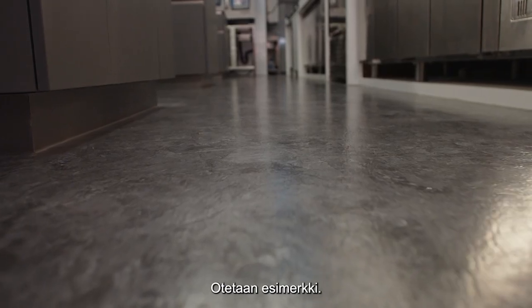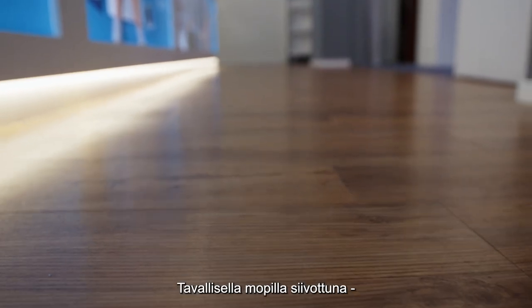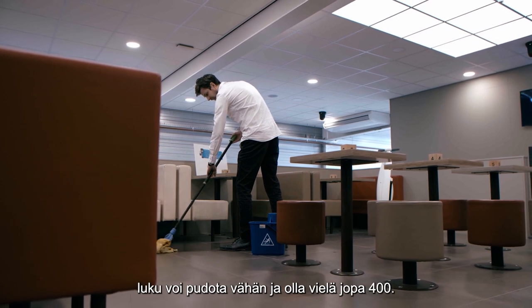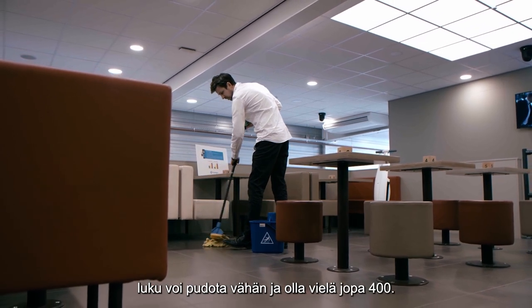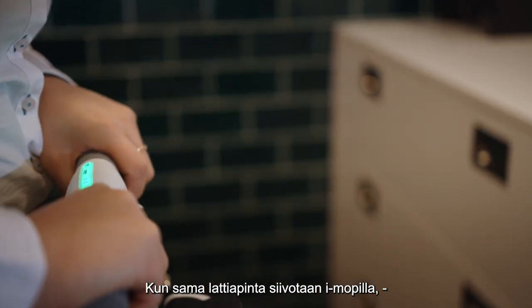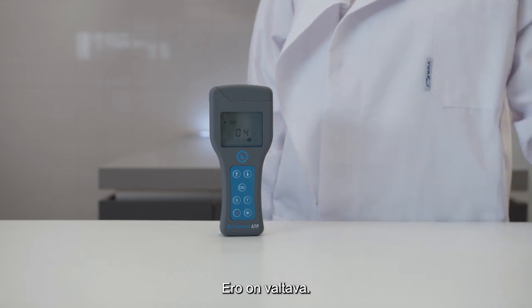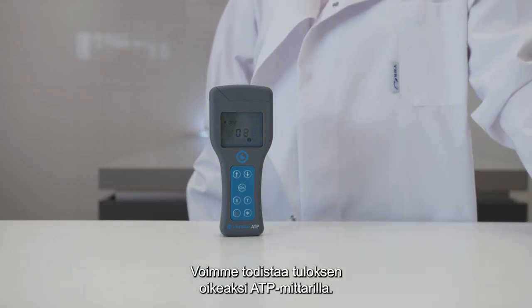Take the matrix for reference. Before cleaning, a surface can have a score of up to 800 RLU. After cleaning it with a normal mop, the score can reach a high of up to 400 RLU. Now, if you clean that same floor with an IMOP, the score will be only 40 RLU. That is a huge difference, and we can prove it with this ATP meter.